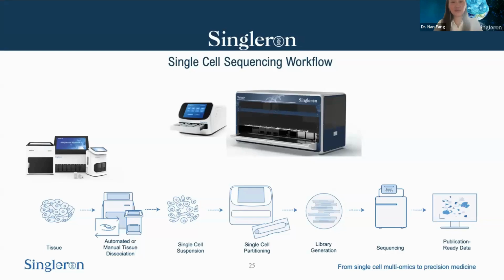Once we have those RNA, on the data analysis part, of course, we will need to map it to the species where our cells come from. But the technology itself can be used for anything that has poly-A positive mRNA.